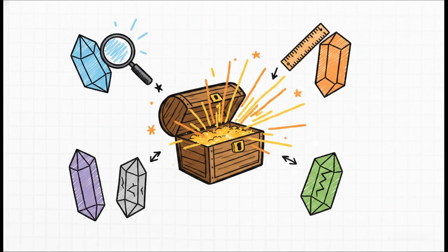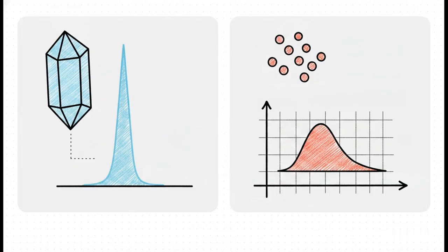But it definitely doesn't stop there. We can also assess the degree of crystallinity. Just by looking at peak sharpness, we can estimate the crystallite size, and we can even detect microstrain and lattice defects hidden within the structure. Pretty amazing, right? Now, there's a really stark contrast to keep in mind here between bulk materials and nanoparticles. If you test a large, perfect bulk crystal, your graph is going to show these incredibly sharp, intense, needle-like peaks.